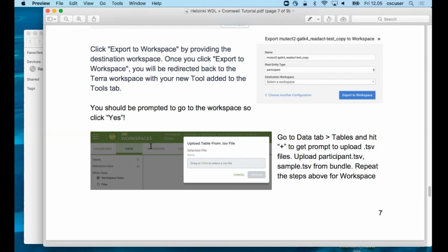Yeah, and then you need to upload your workspace data. If you just press on that, you can select which one. I'll get to that in a second. When we choose the wrong one, it uploaded successfully. Basically, it knows which one is the right one.